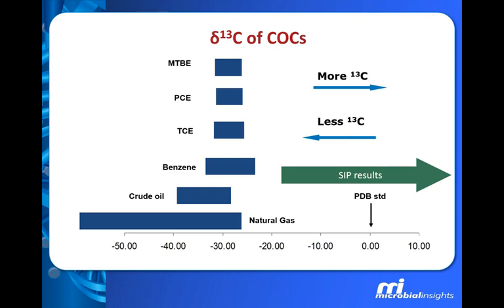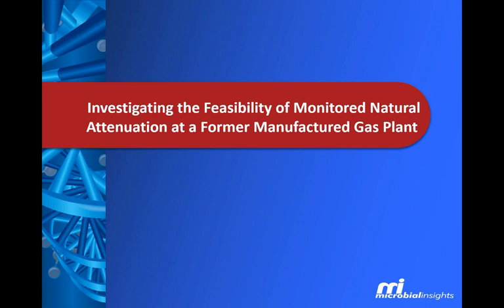as they're found in nature or produced industrially. Now when we do stable isotope analysis, we're going to be talking about del 13C values that are way off this chart, highly positive values, indicating very clear results that the C13 content of the biomass, the molecular biomarkers or products of mineralization are much, much higher than would normally be found in nature and will be proof positive of the incorporation of carbon 13. So let's look at a couple of examples.